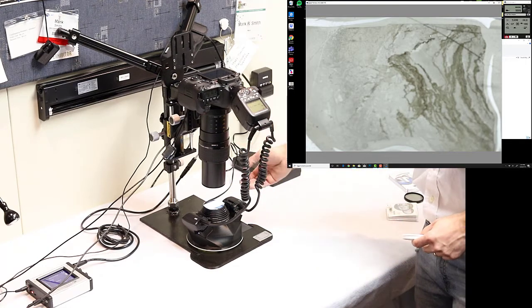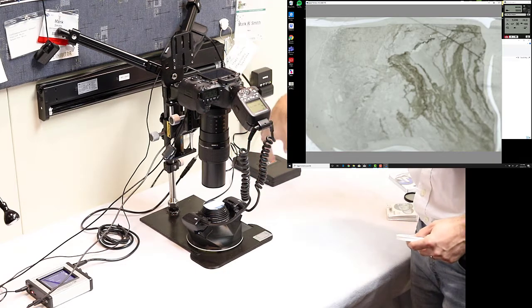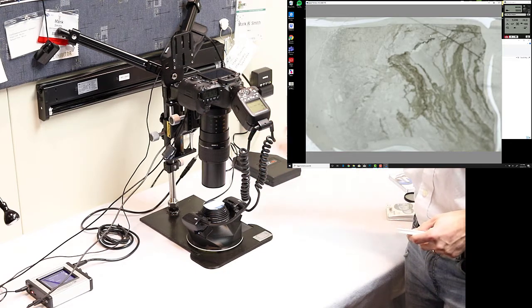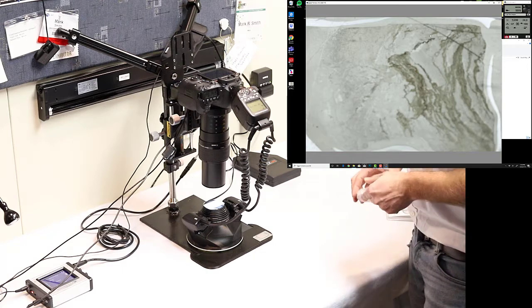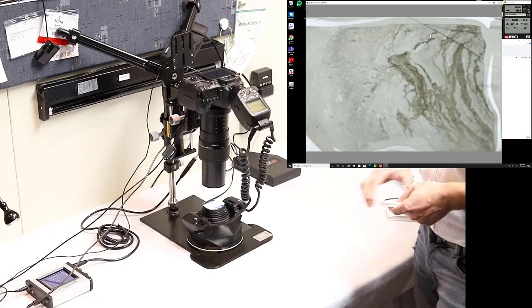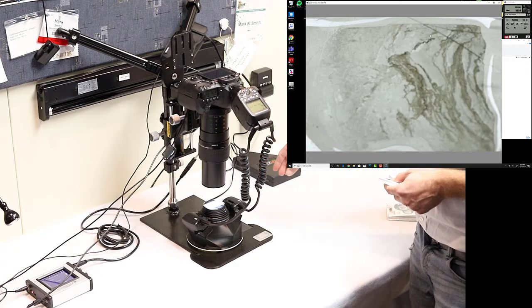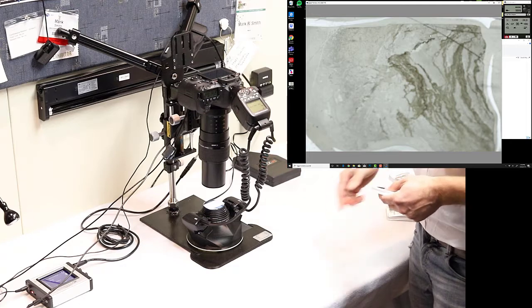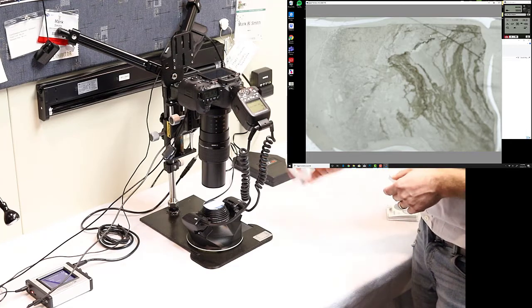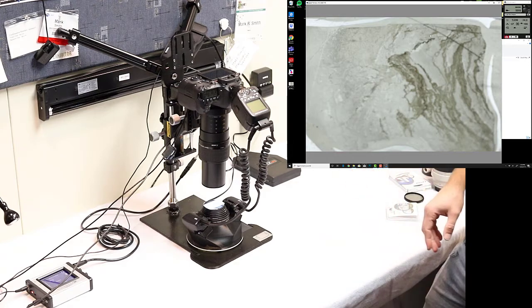That way you can combine a mixture of transmitted and reflected light sources to fully illuminate your specimen, and that leads to very, very high quality photos. So it's kind of nice to have your diffuser on there if you need it. In this example, these slides and thin sections don't have any of those really thick or opaque materials, so we're not going to worry about it, but just so you know, you can add a diffuser to change the way that you use your light.